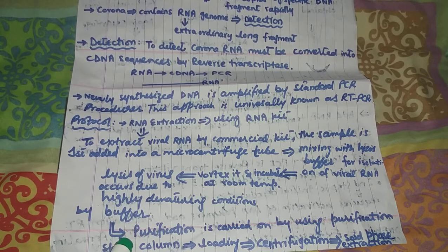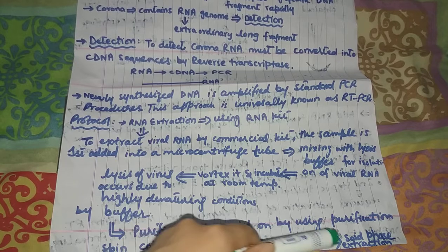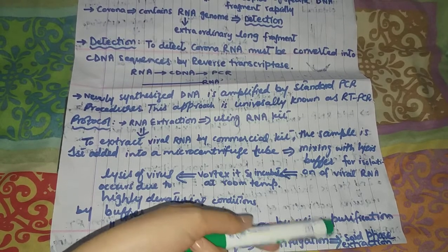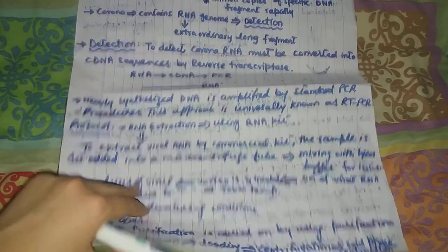After this lysis, the next step is purification, which is carried out using a purification spin column. We load it, then we go for centrifugation, and then we go for solid phase extraction. Why are we calling this solid phase extraction?